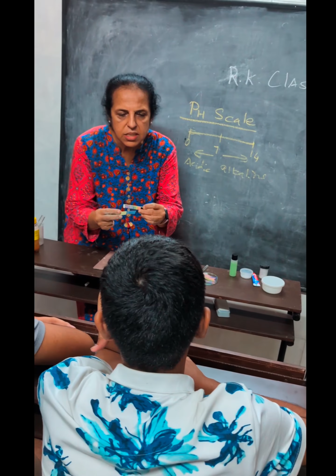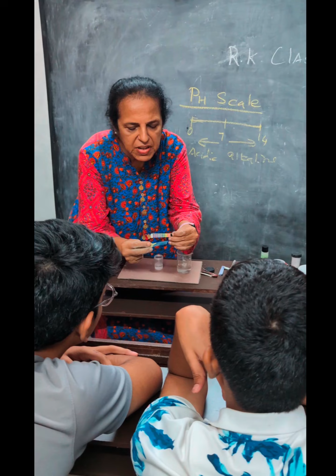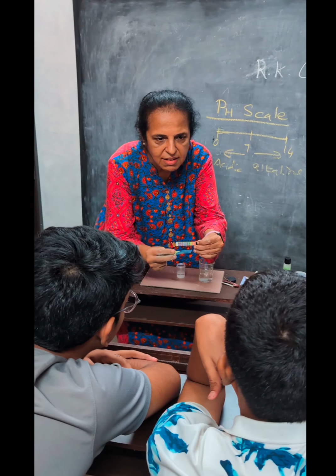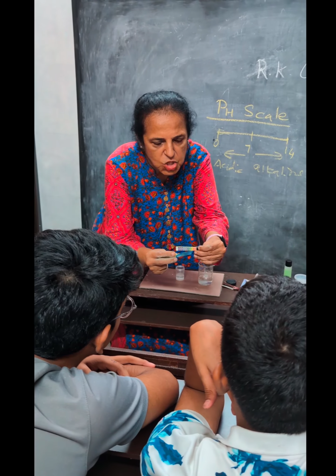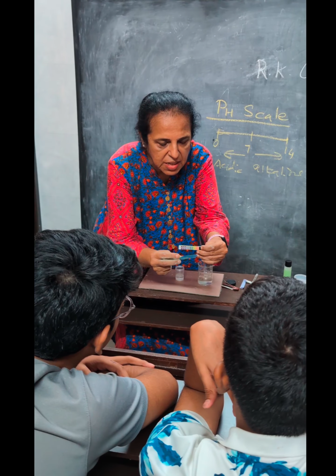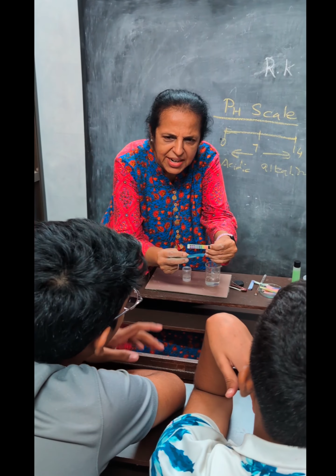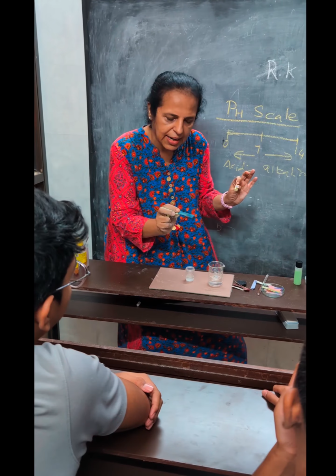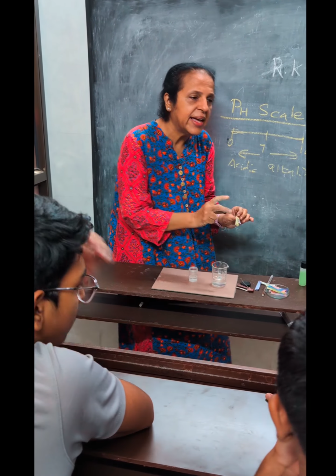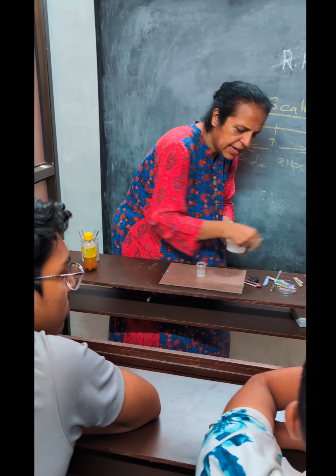Now just see whether it relates to the pH given corresponding to this line. Is it coming in alkaline? Firstly, no, it's not exactly as they said, but at least it is basic. It is above that, but it is in the alkaline range. So this gives an idea. Now let's try with acid.